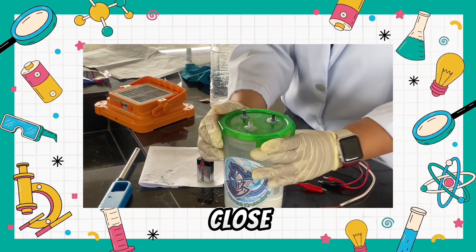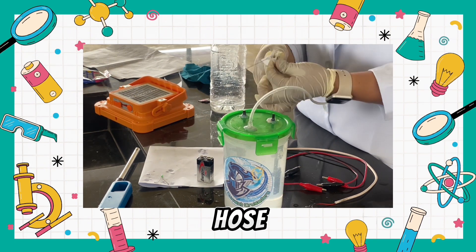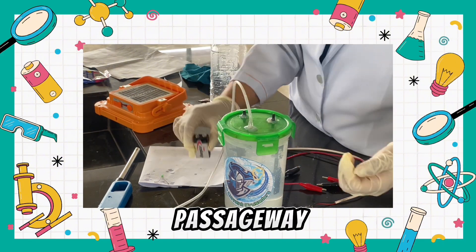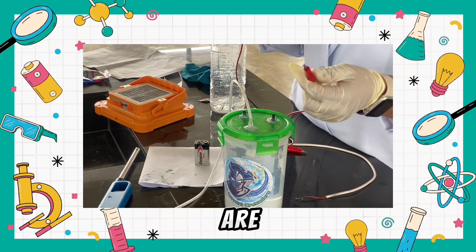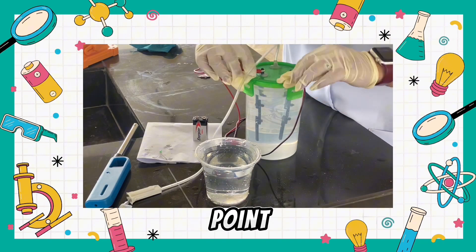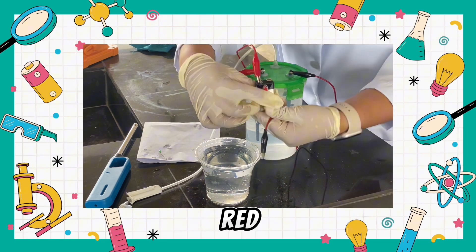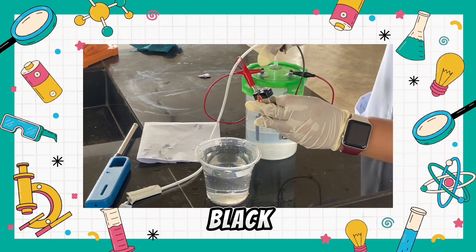At this point we have to close the container. We have here a hose for the passageway for the hydrogen, and here are the alligator clips — red for positive and black for negative. At this point we are going to connect it now to the power supply: red for positive and black for negative.